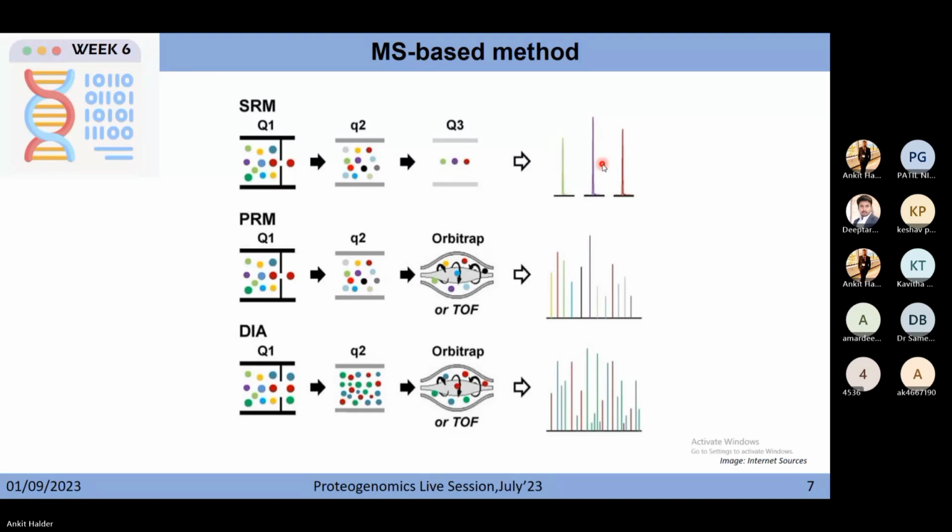So this is your selected reaction monitoring or multiple reaction monitoring. It is known as multiple reaction monitoring when you are looking at multiple transitions at a time.